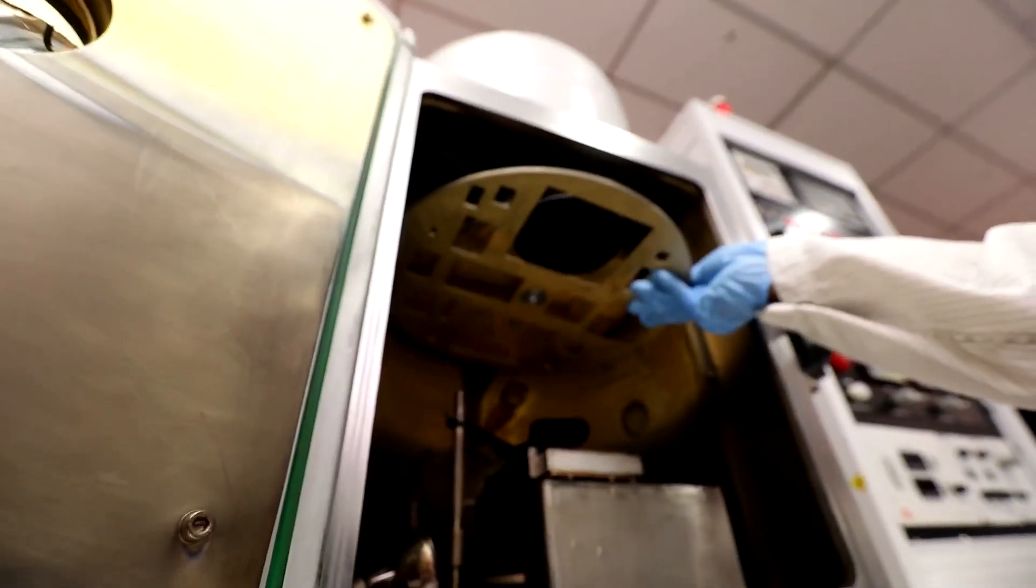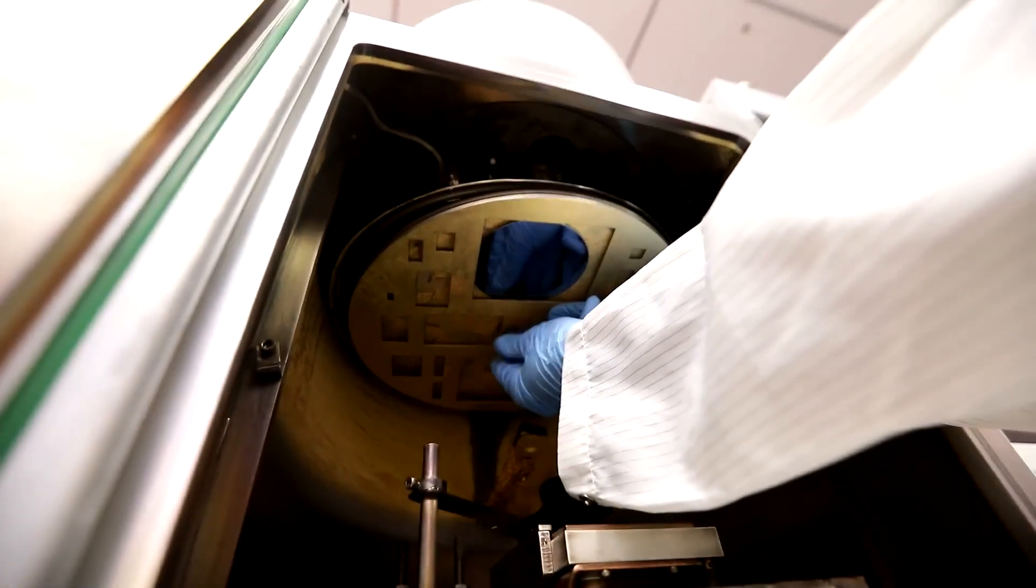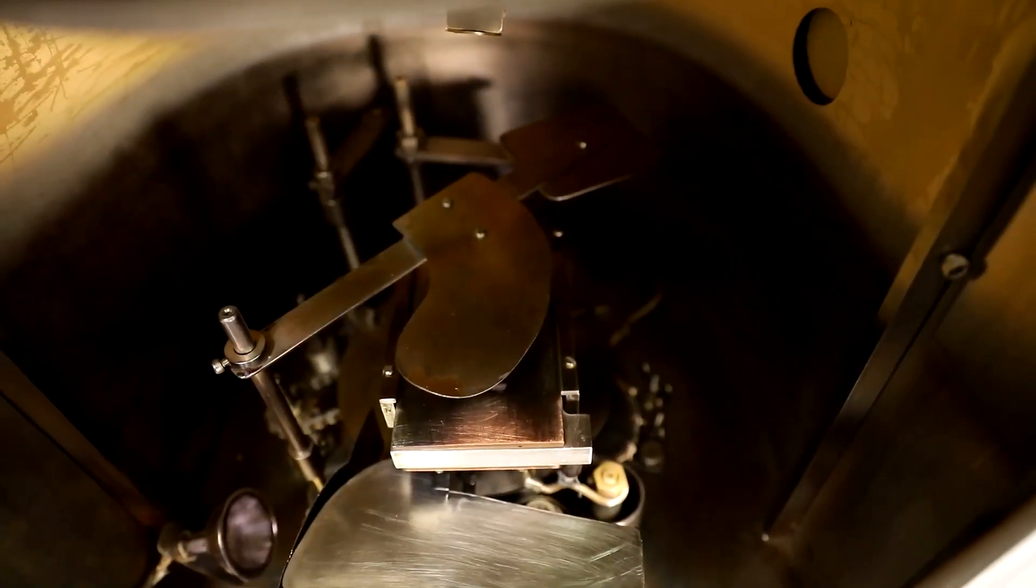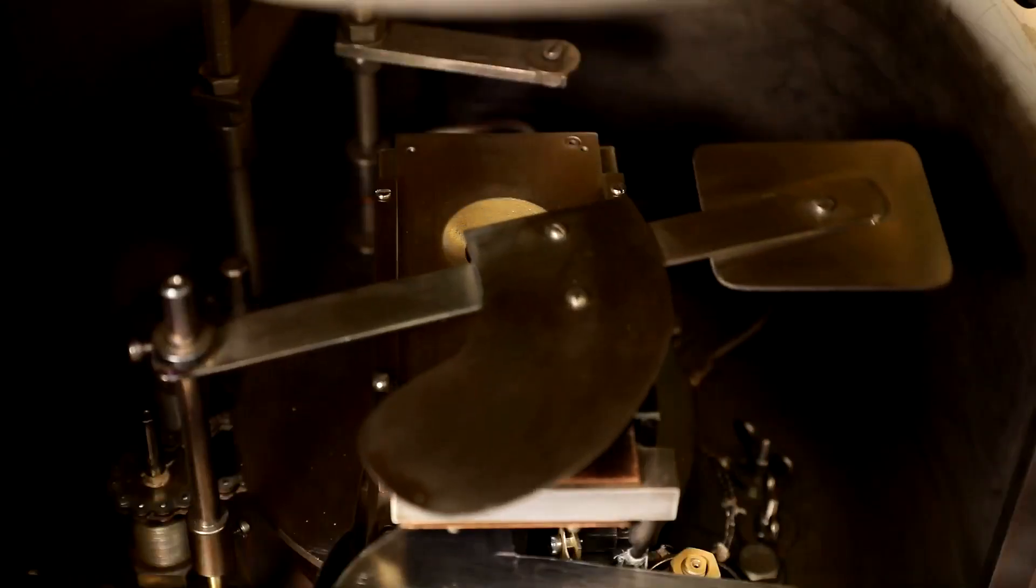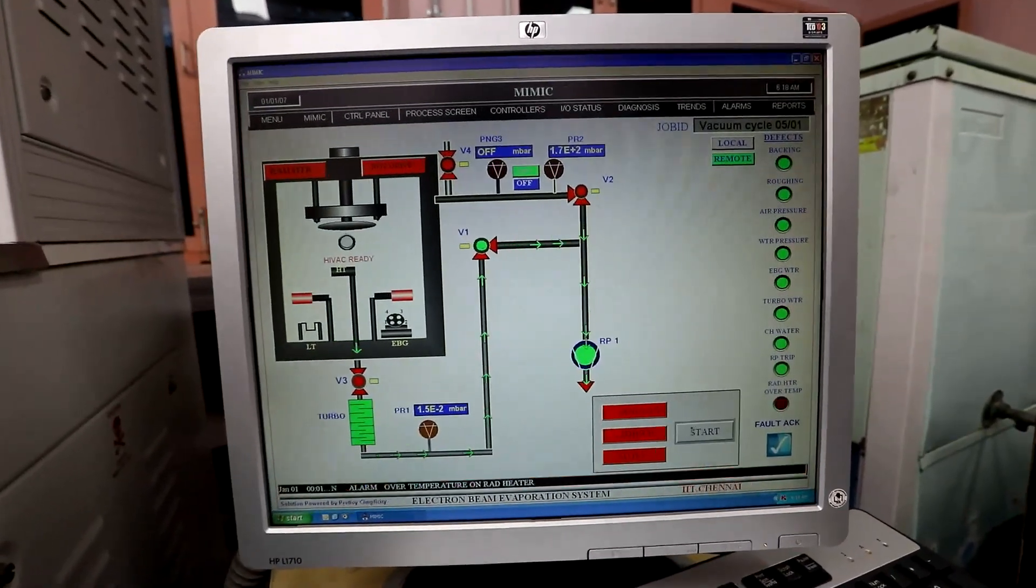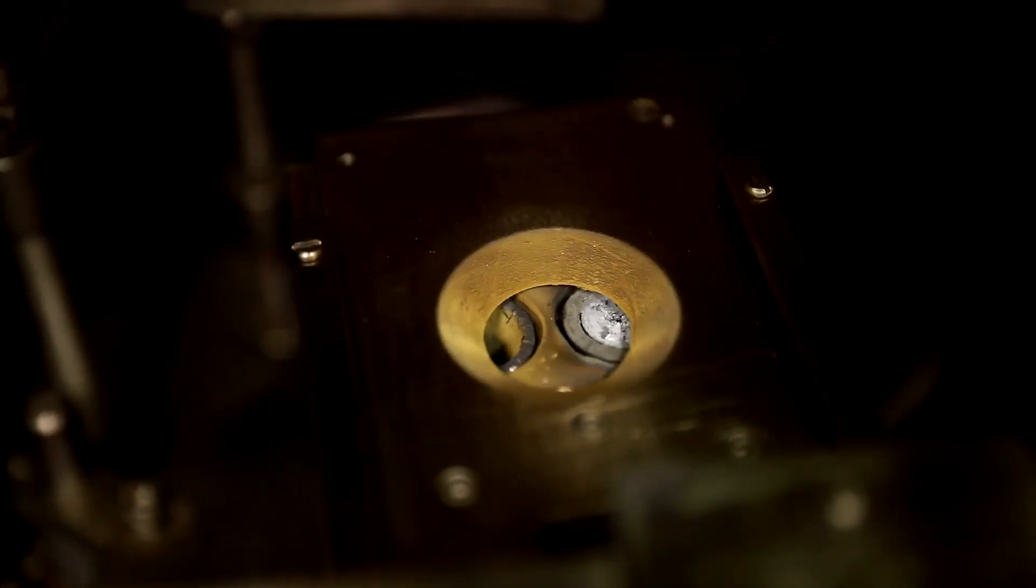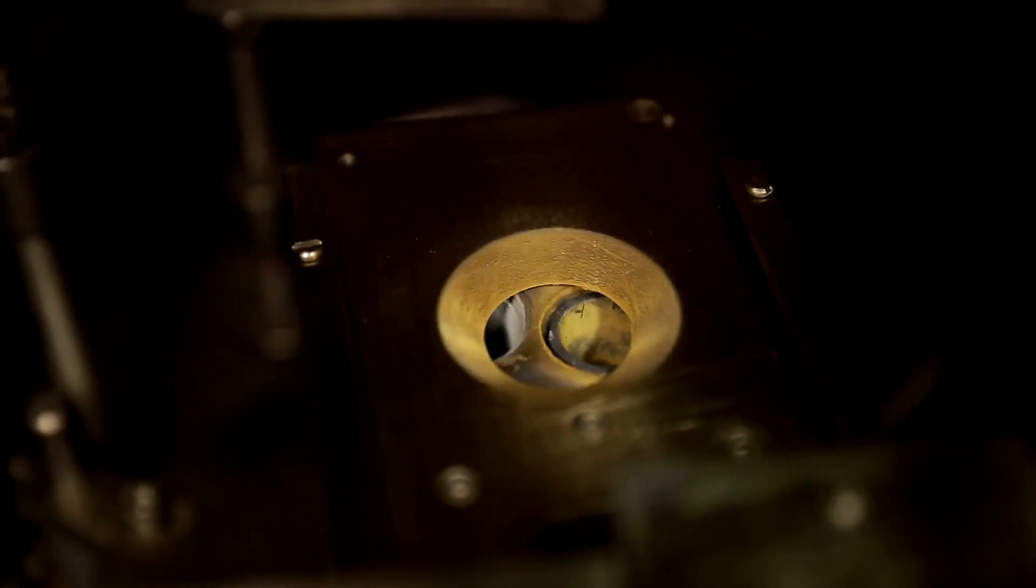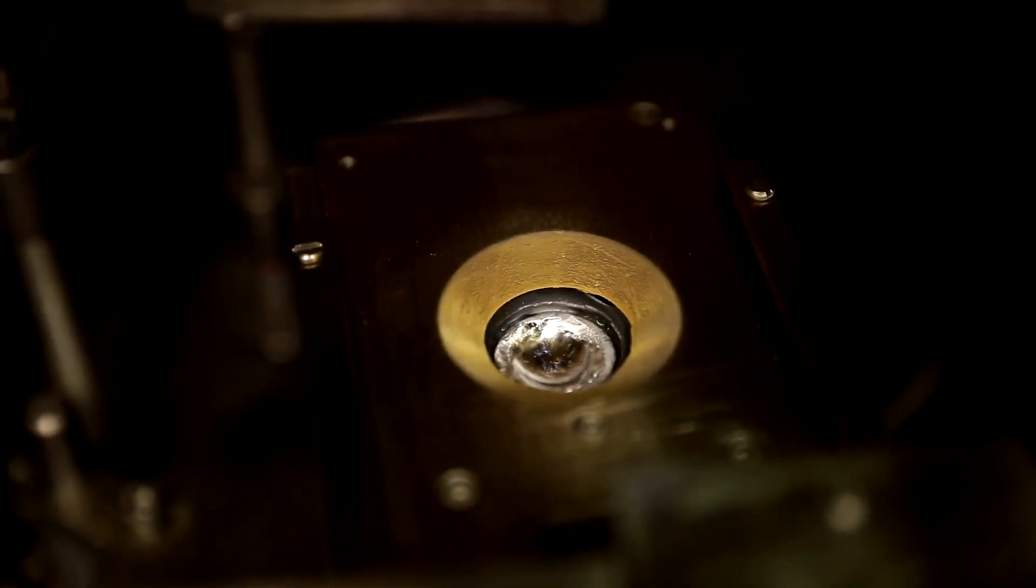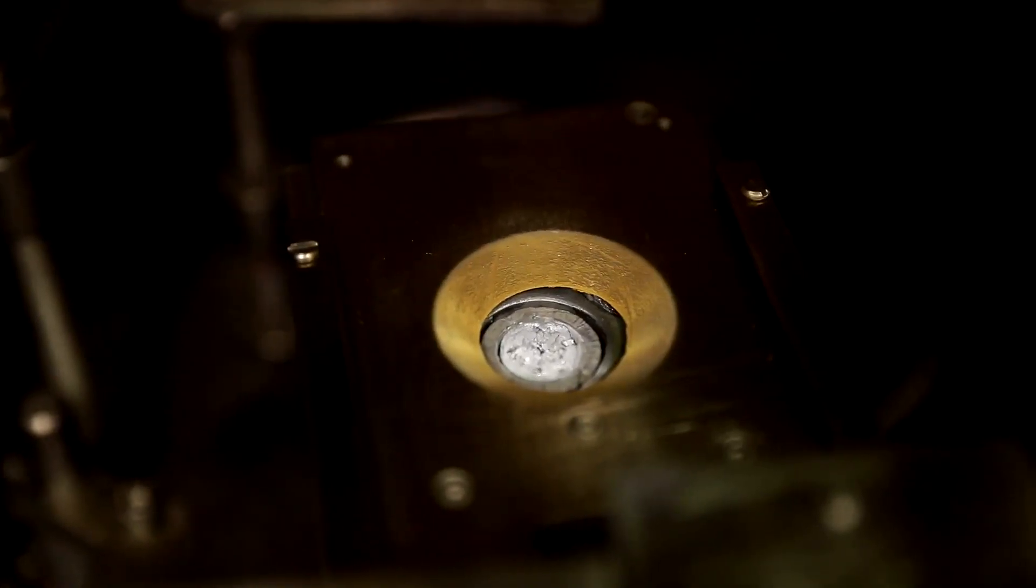Now let us place the sample holder inside the chamber and here it is held tightly by the bolt. We have to open the shutter in order to see the crucible. On the computer, click the process screen, then click on shutter which causes it to open. Here we have rotating pockets that hold the source material that can be dialed into position for different target materials to be applied to the substrate. Now close the shutter.